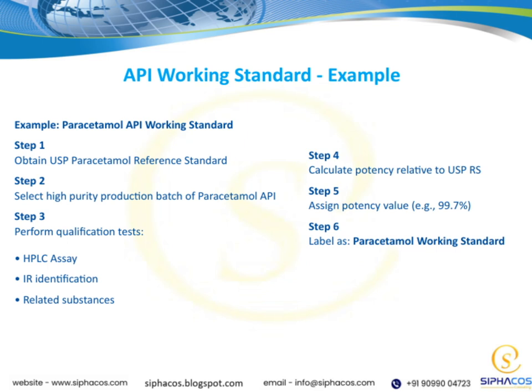This assigned value provides a clear, quantifiable measure of the sample's strength. Finally, in step 6, we label the sample as a paracetamol working standard. This label indicates that it's a validated, reliable standard for use in quality control and testing.